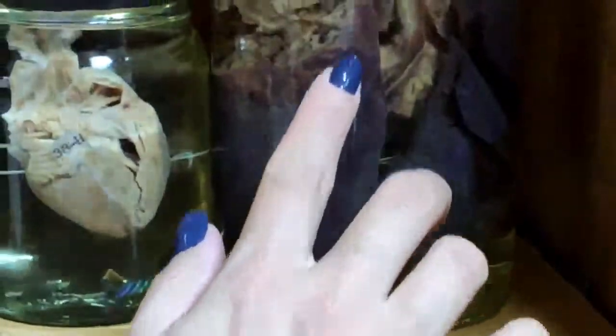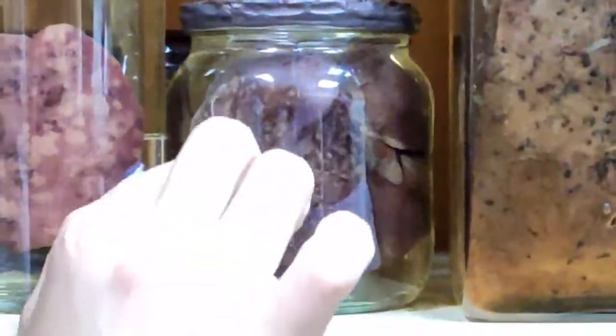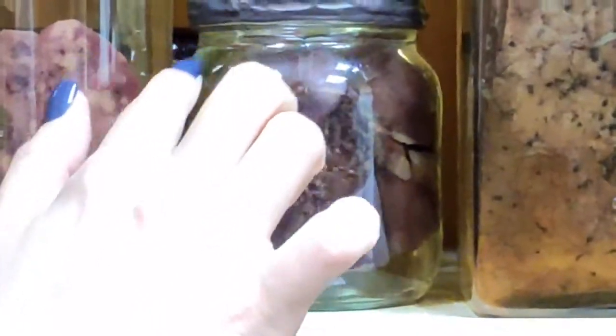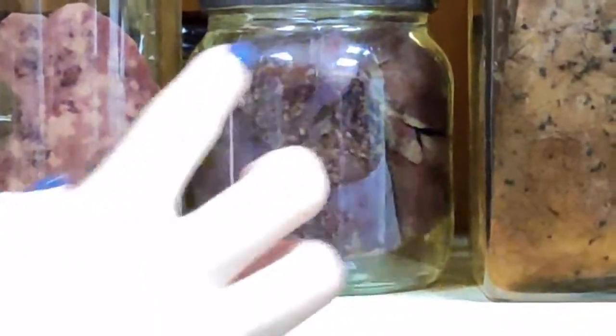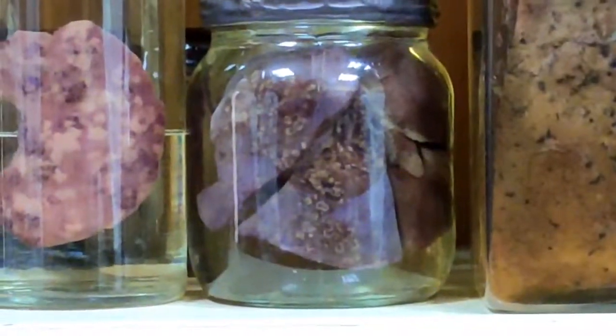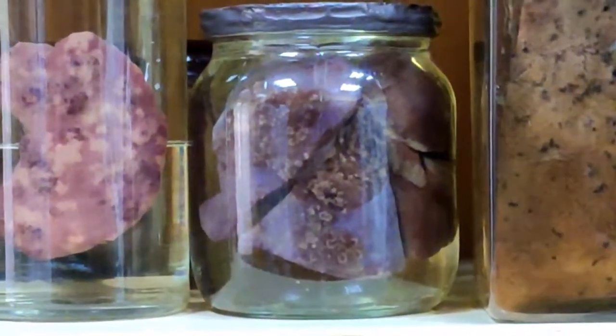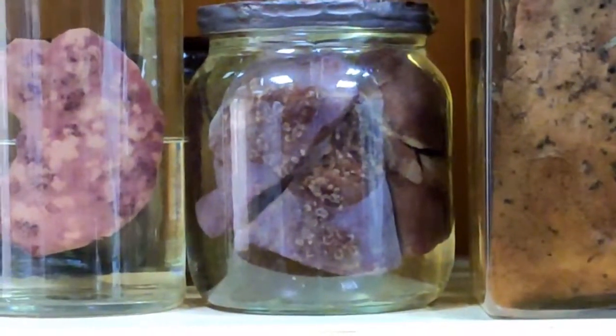What is this? So now this is tuberculosis. So yes, this is focal pneumonia, and you can see a lot of zones which can involve the upper lobe, lower lobe, and it goes with the branching of the bronchi. So the bronchi are branching in different directions, and all these foci of pneumonia go accordingly to these bronchi.